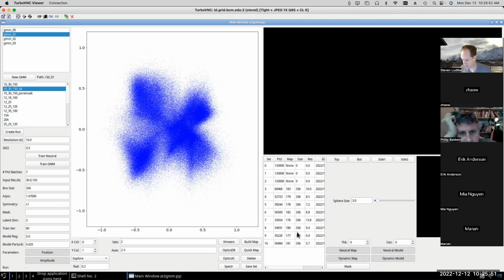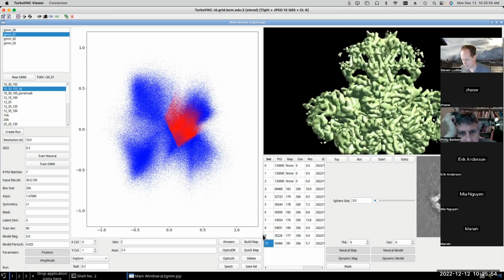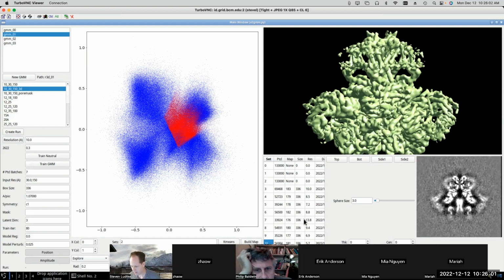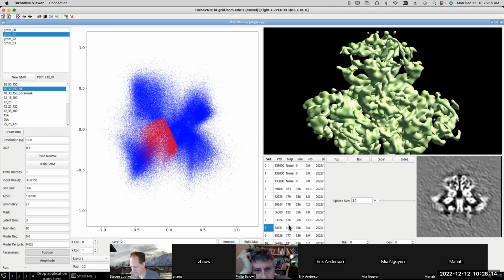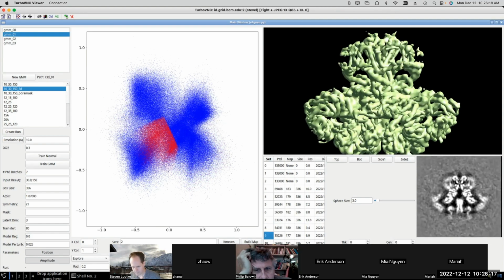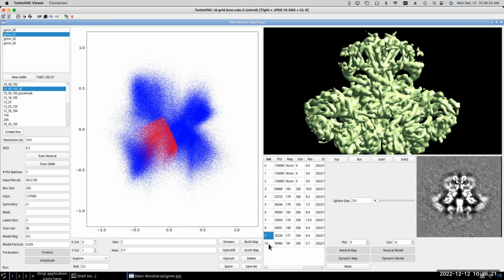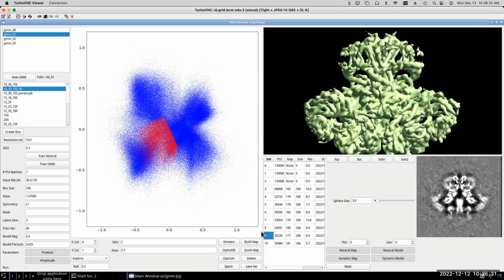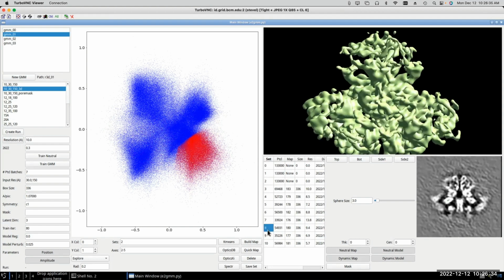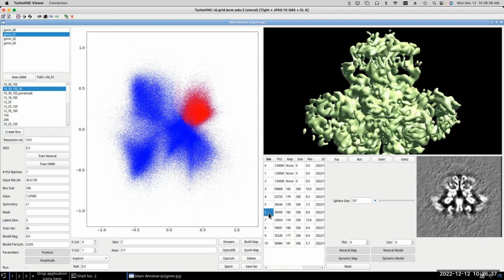When I did the classification here, and still see this nice, interesting structure, I didn't see the same sort of thing happening at all, right? So I mean, there is this data set which is only 13, but you can see even that, the 13 still at least looks like it has sort of the right shape. And certainly there is a little variation in how homogeneous these different data sets are. Right. So this one, which gets to 5.7, you can see it's a little sharper looking. I mean, this is getting somewhat filtered up here based on the determined resolution here, 9.4.